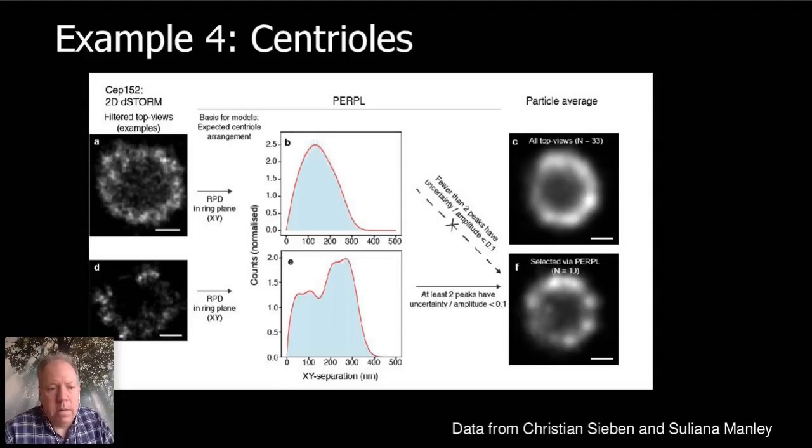Is it possible, do you think, to use this kind of analysis, RPD analysis, in other super resolution data, so STED or SIM data? Yes, absolutely, because the basic principles are exactly the same. It's just looking for patterns in any type of data. As long as you've got some sort of XYZ format for your data, or even just XY. I suppose STED or SIM don't usually come out with a spreadsheet as their answer, unlike localization data, which naturally comes out as XYZ coordinates.